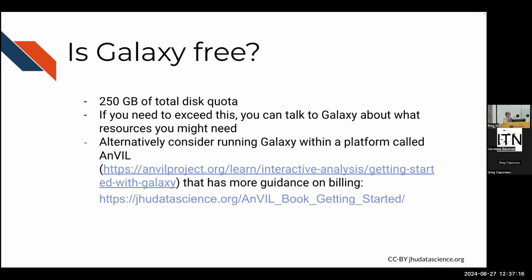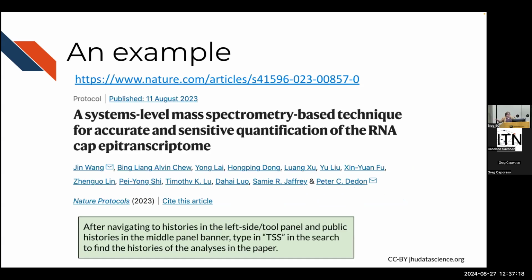Here is an example of a team that used Galaxy and they were able to provide their workflows to the public through Galaxy so that everyone could see what they did. And so this was a very reproducible example of them using Galaxy in their research.